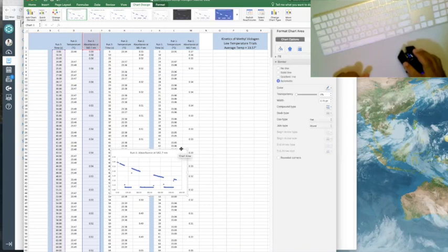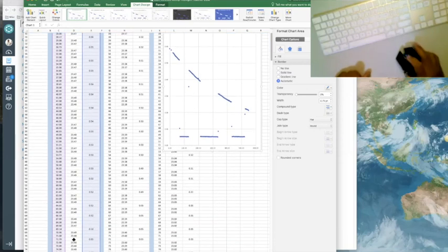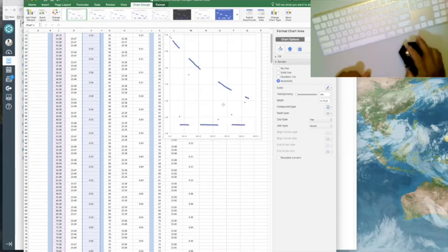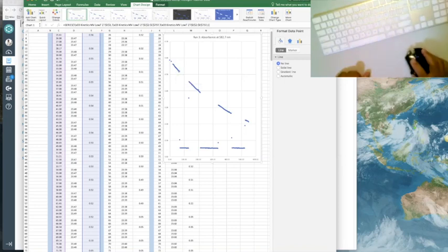Now, let me show you the problem with this data set. The problem is that you can't just randomly start to select points from here, because suppose you select a point, say at 100 seconds. 100 seconds is right here. The problem of selecting a point at 100 seconds is that you have no real data between this point right here, which is happening at 66.58. If you look at the fine print here, let me zoom in.